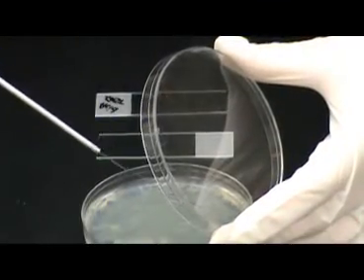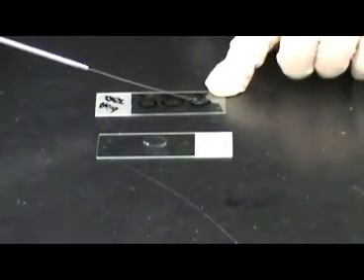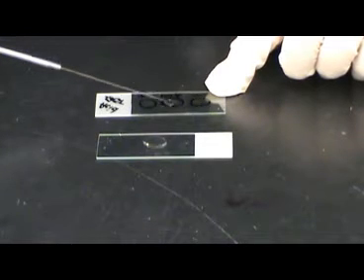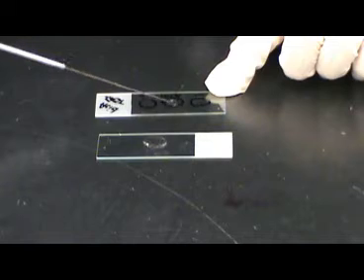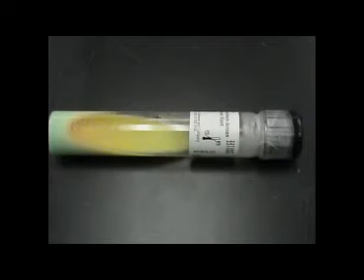start adding bacteria. Here, Staphylococcus aureus is being added first as a negative control. Mix the bacteria carefully and gently with the water in the circle labeled negative. Then, carry the loop over and mix it in with the water in the circle labeled mix. This process will be repeated after sterilizing your loop with the positive control.